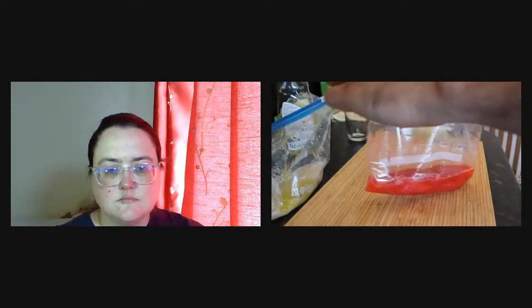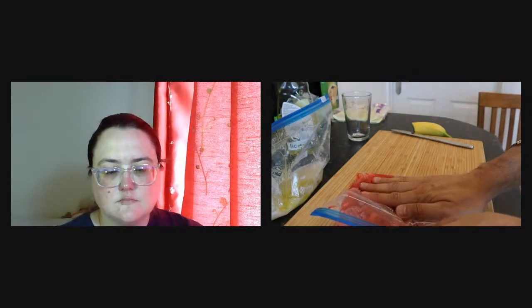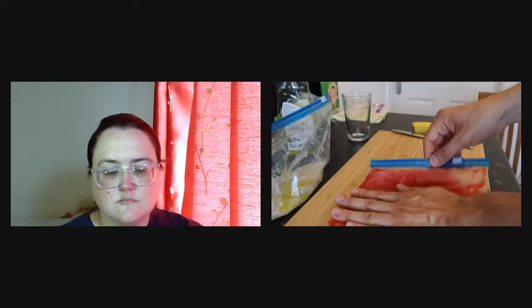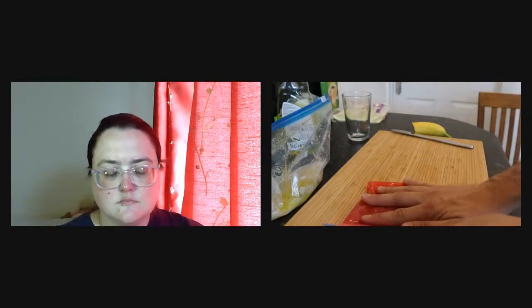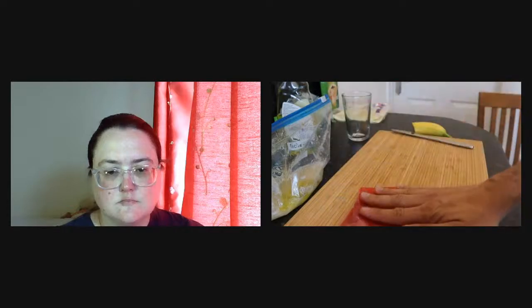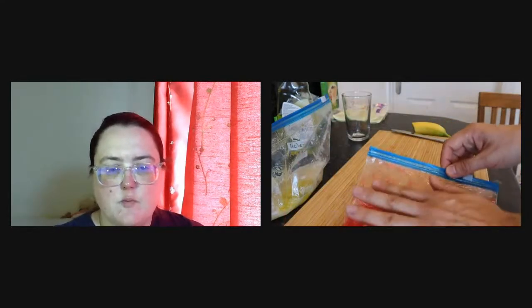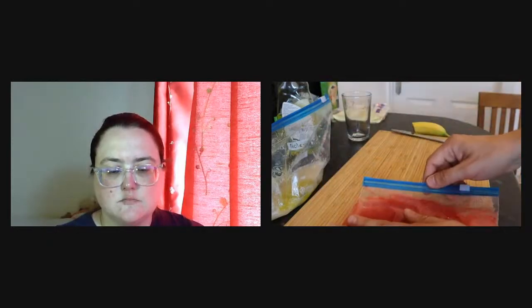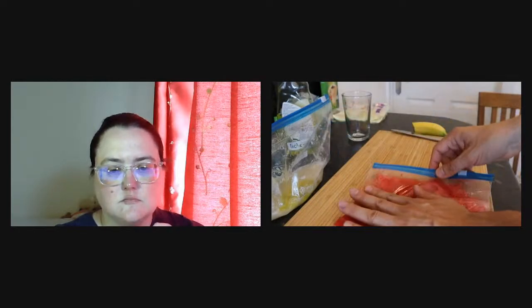Okay. And now, again, you are going to want to mix once again so that we really have all of that dishwasher soap being mixed very well. We want to avoid making any bubbles when we do this, but we really want to suspend everything. Okay. Does it matter if we use too much washing up liquid? No, I don't think it matters very much. You need to have quite a lot, but I don't think too much is a problem.